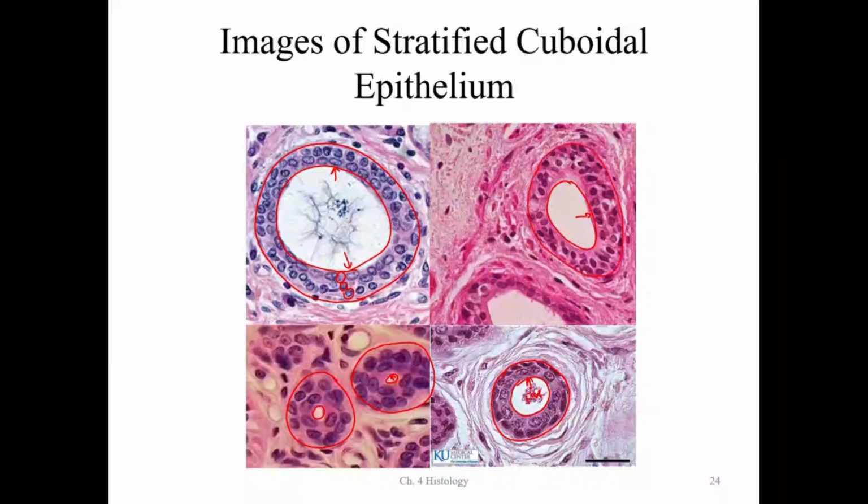Now, all this other stuff over here, that's just all connective tissues that we don't worry about yet. That's just connective tissues and other kinds of tissues that we have in the body. So we're not going to worry about those. We're looking for the epithelia.